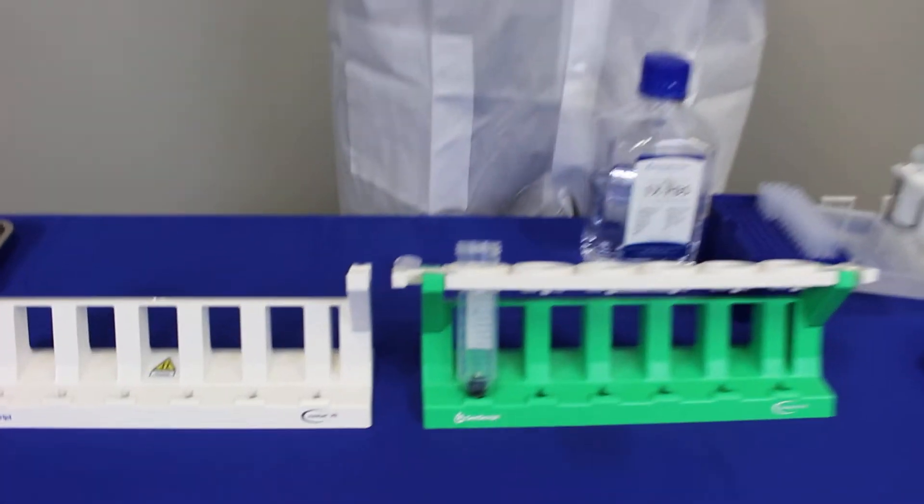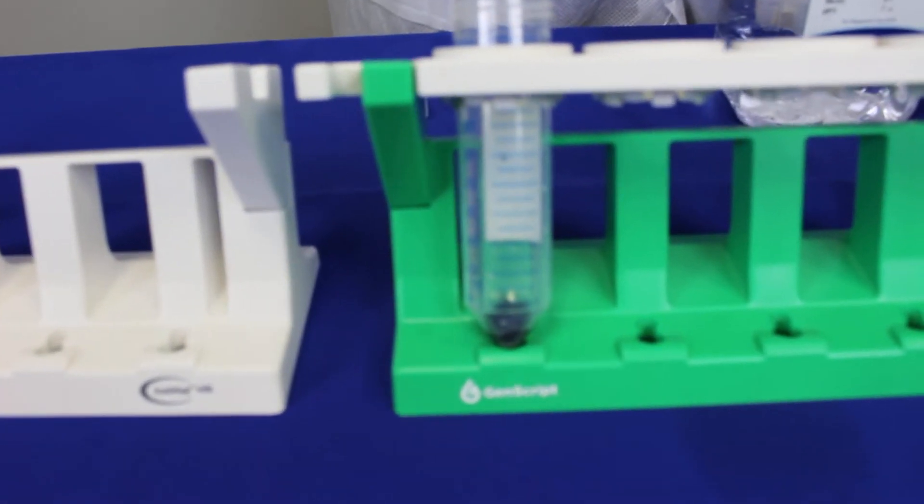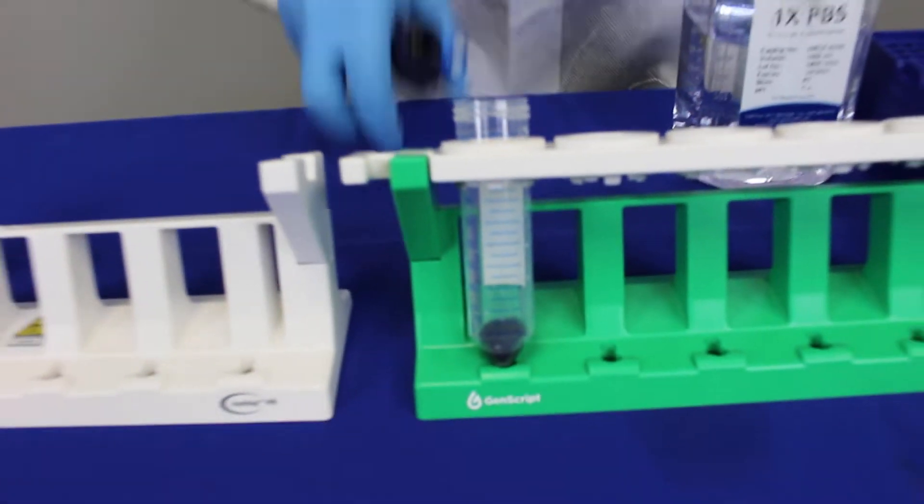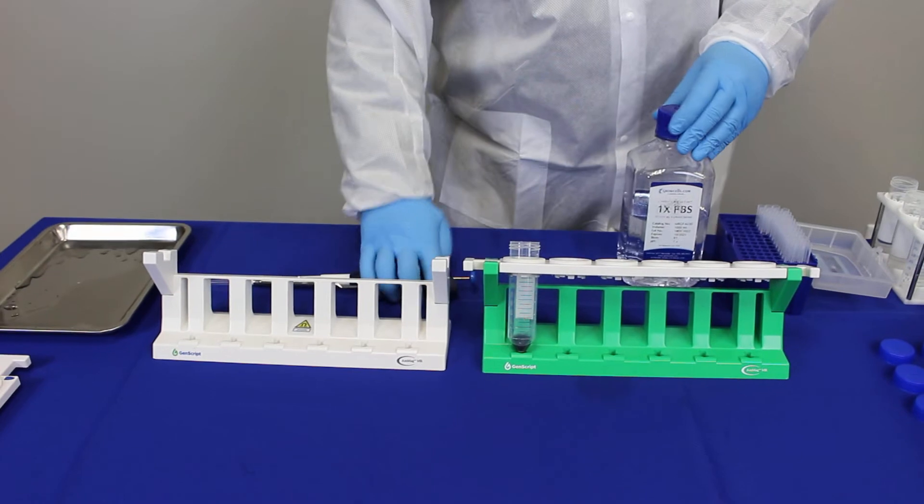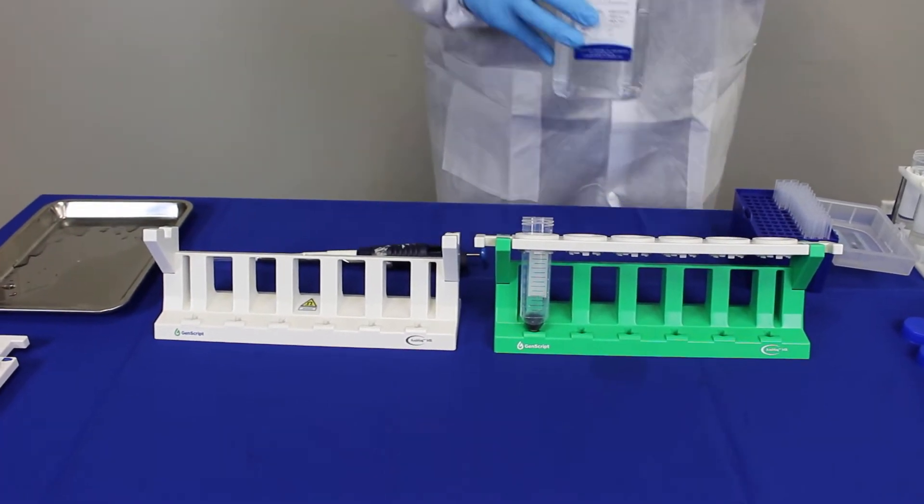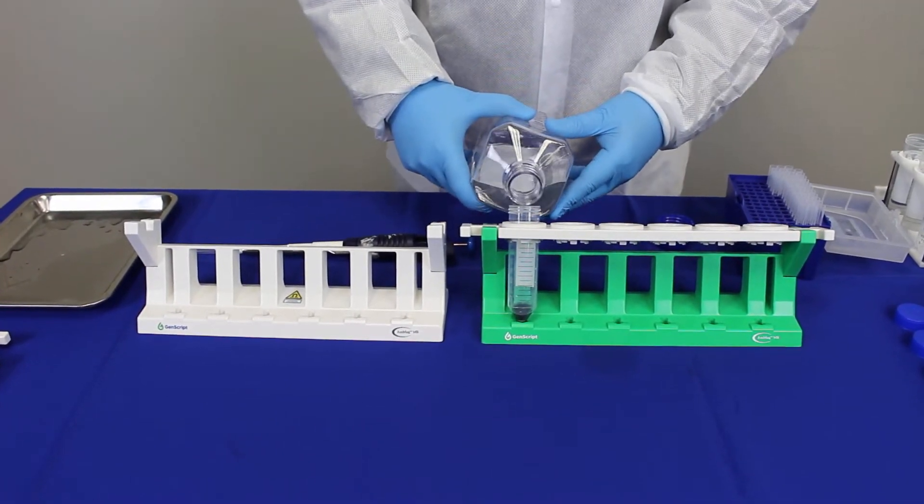Put them in a 50 ml tube, and then just use the PBS to wash them. The volume doesn't really matter.